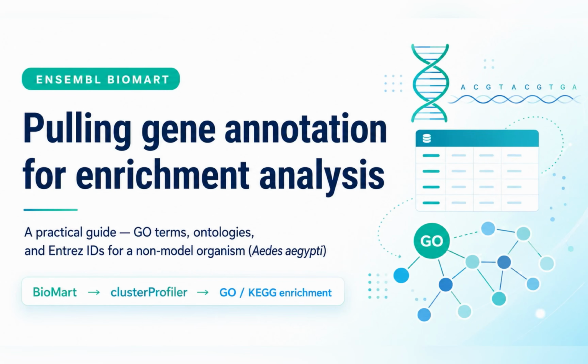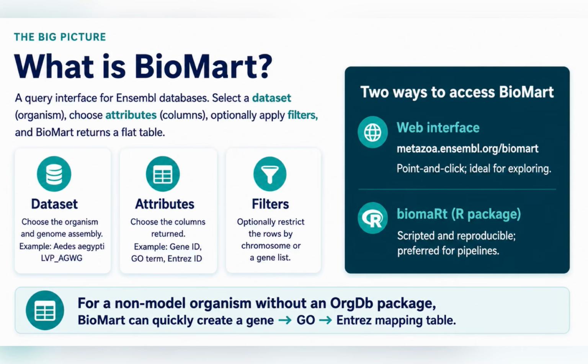In this tutorial, I will show you how to retrieve gene annotation from Ensembl BioMart for enrichment analysis. We will use Aedes aegypti as our example. What is BioMart? BioMart is a query system that allows us to retrieve information from Ensembl databases.